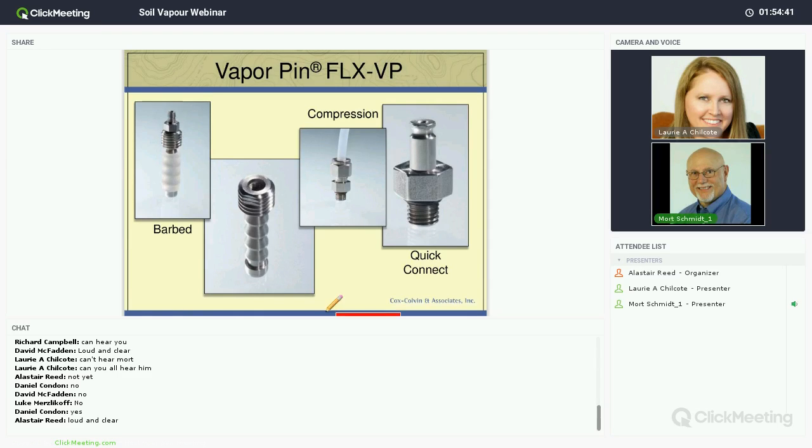Another device that you can put in the top of the vapor pin is this quick connect made for us by NTech. And this goes to NTech hardware, which just more or less snaps in place with no accessory tubing. And again, no accessory tubing, it can go directly to bottle vacs, certain containers, etc.